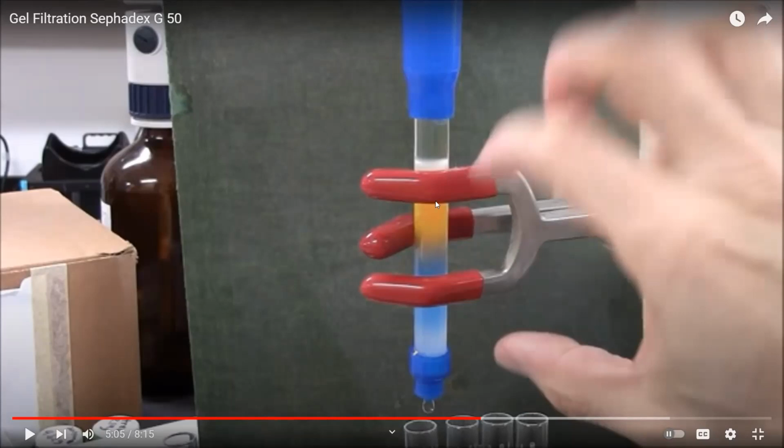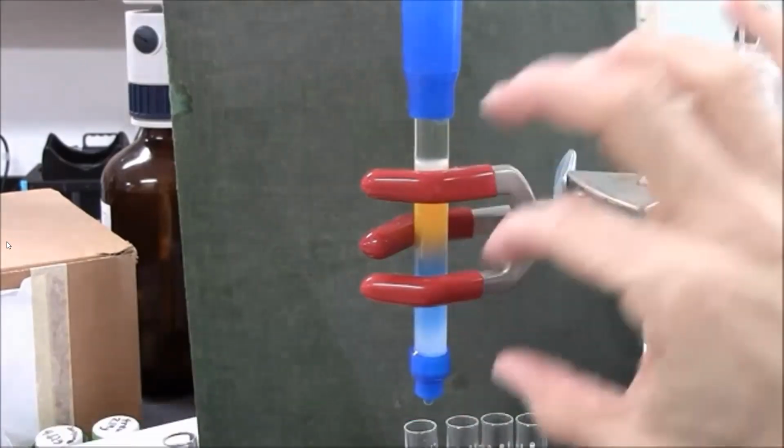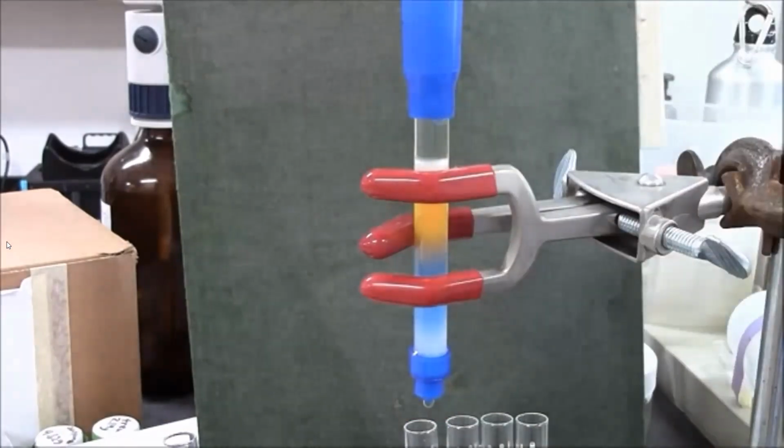So what is he concluding? Because he's not seeing a distinct separation. He will achieve distinct separation only if the length of the column is higher, longer. Okay, now here the length is limited. Now that's what he concluded, that maybe the sample loaded was higher. For the blue molecules to elute, they'll actually be separated from the yellow, but it's going to be close.